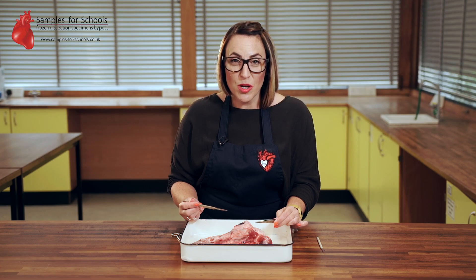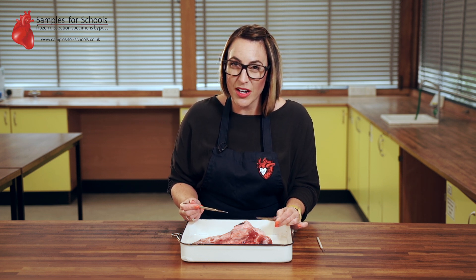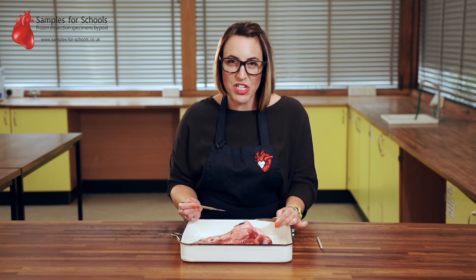When you receive your sample one option is to do an eye dissection. For more details of that you can see our eye dissection video. But to remove it from here it might need some gentle persuasion.